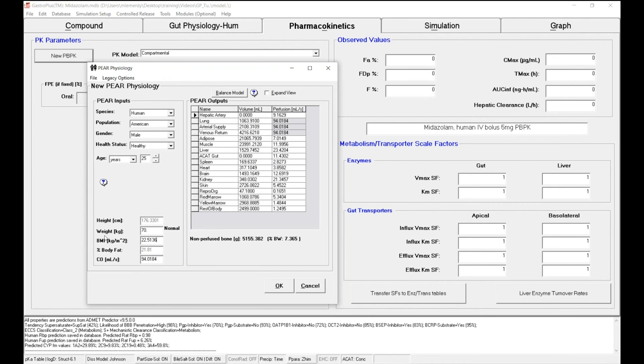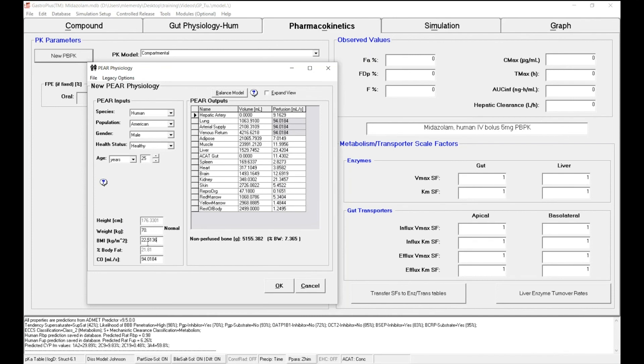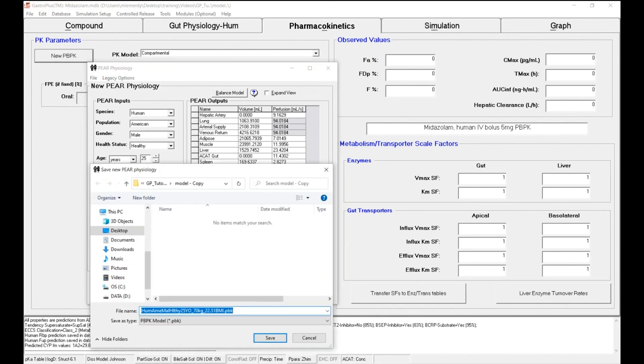Once again, when I change the body weight, the tissue volume and tissue perfusion also change to create the specific physiology for a single individual: American male of 25 years old with a body weight of 70 kilograms that results in a BMI of 22.5. Now I can simply click on OK. And the model automatically asks me to save that new physiology in my database directory. I can simply click on save.